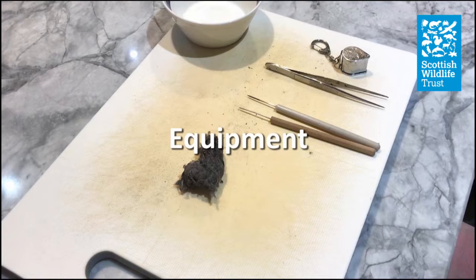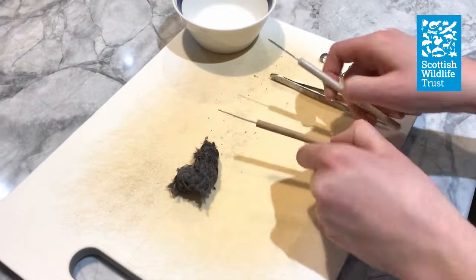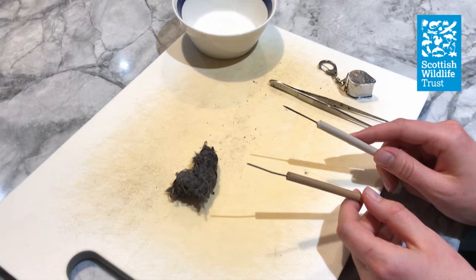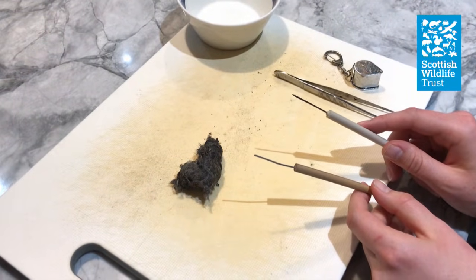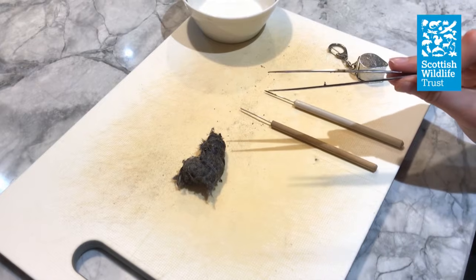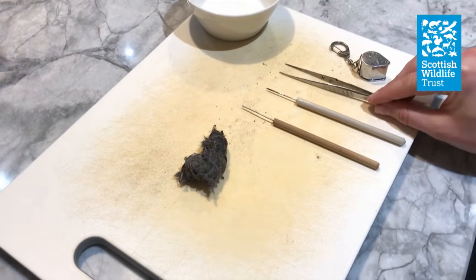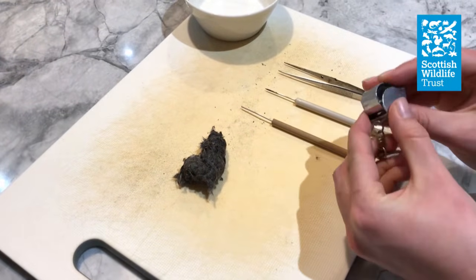You don't need much equipment to dissect an owl pellet, but there are a few things you might find helpful. Mounted needles can help you to remove some of the fluff, particularly from inside skulls. I'll be using these two from a dissection kit, but you can easily make your own by pushing pins into a couple of corks. You might also find a pair of tweezers handy for picking up really tiny bones. And finally a magnifying glass will help you to see the really fine detail of the bones, which might also help with identification.